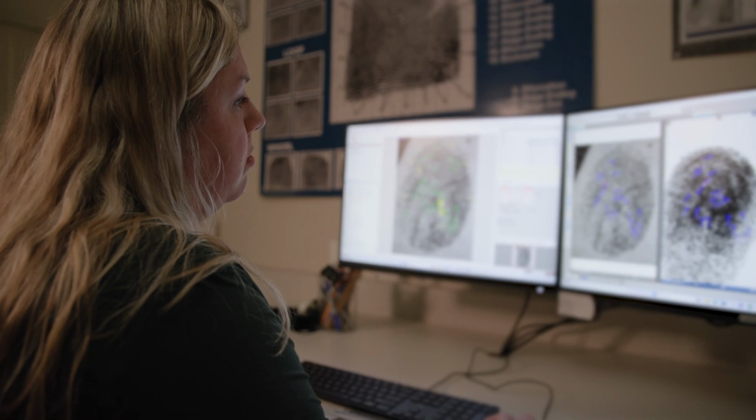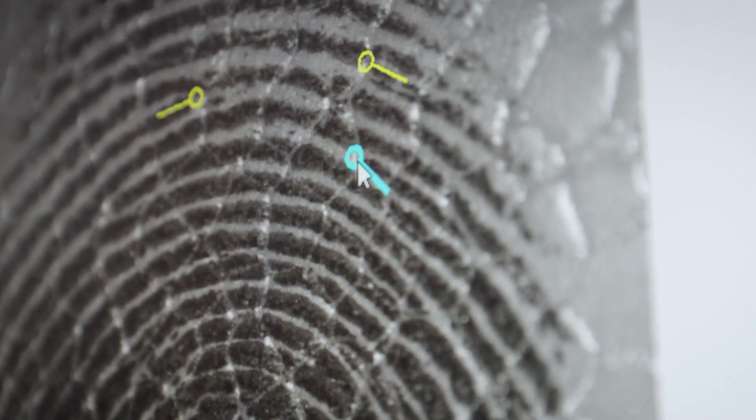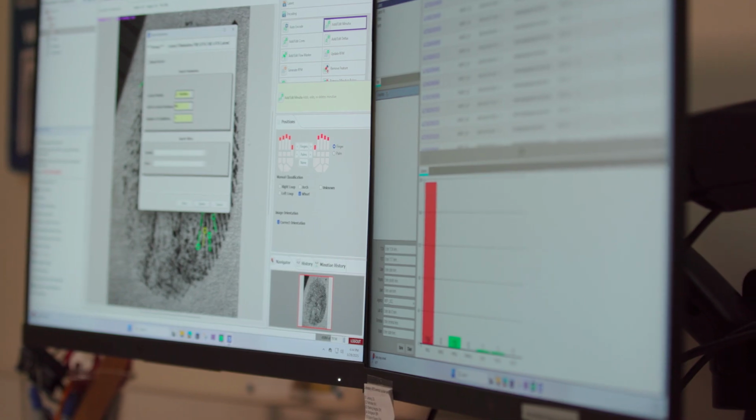On prints, there's all these different things that interrupt that normal ridge flow that we're looking at, and that's what makes it more unique. We have certain thresholds that we have to meet, so we're not working on a piece so small that it could be common. We have access to a database of known impressions. Once we have enough to make a determination of either an identification or an exclusion, then we will have a second examiner verify. If we don't get a hit, the prints remain on the database, and as people get fingerprinted, those new prints that are entered into the system get run against all of the ones that remain unidentified in the system.